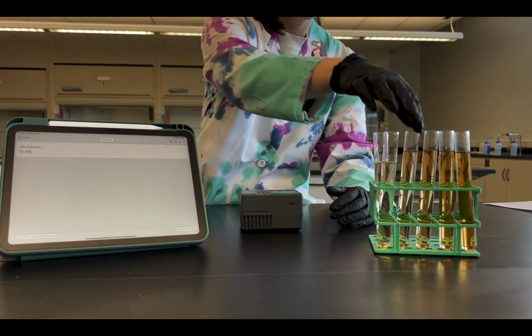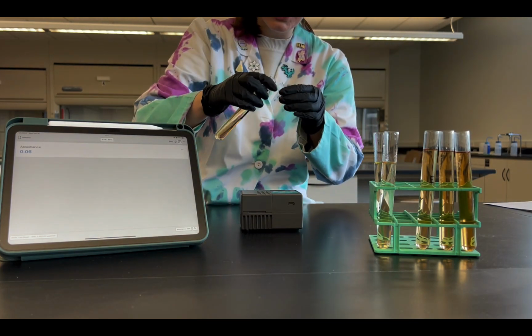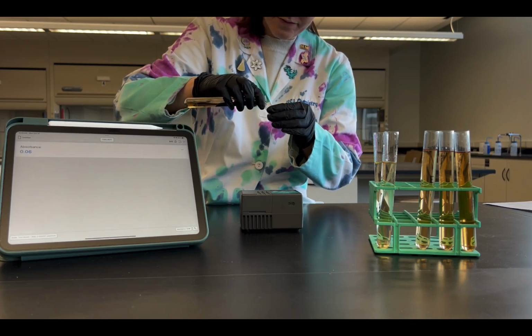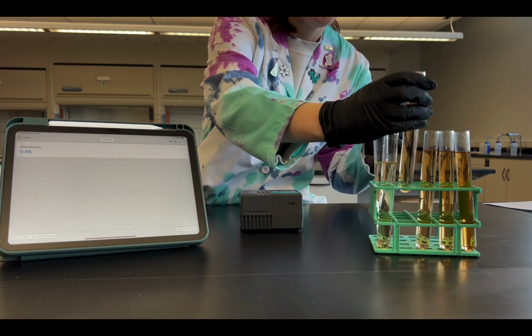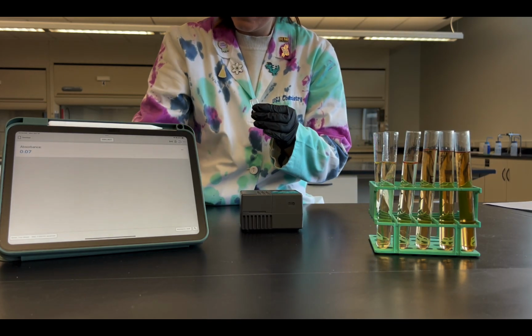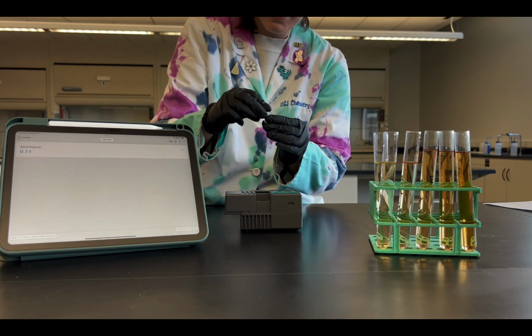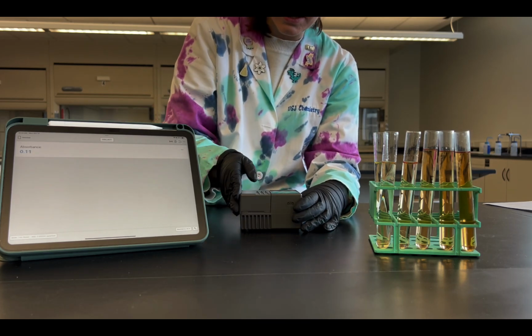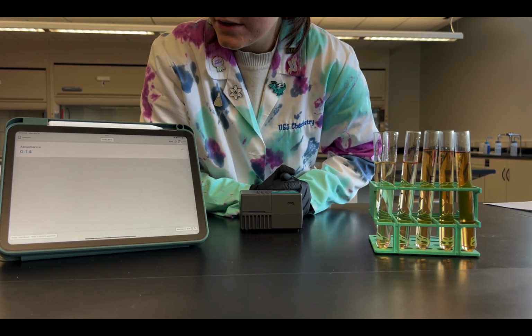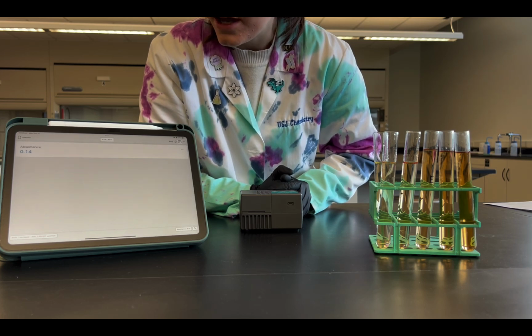Okay, so now we can do the next solution. Now I'm going to do test tube number 2. So here's test tube number 2. We should see that absorbance go up a little bit more. And there it goes. 0.14, 0.15, kind of through there.